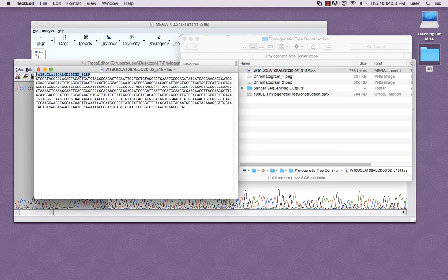This header line is customizable as long as you have this caret, so you can rename the sequence, add the length of the sequence, or even a brief description if it helps. You can also start building libraries of FASTA files by collecting all the sequences in one text file. Now repeat the process for the rest of your isolates.